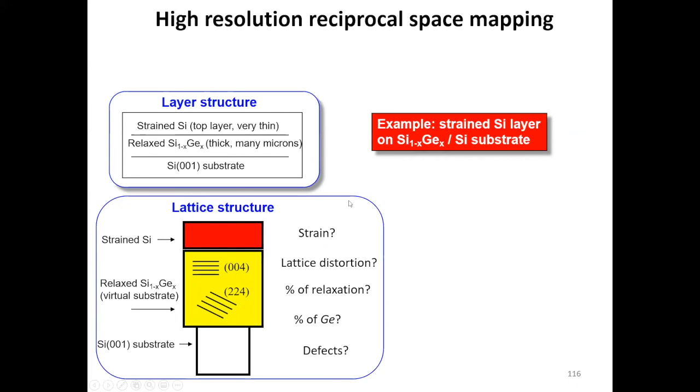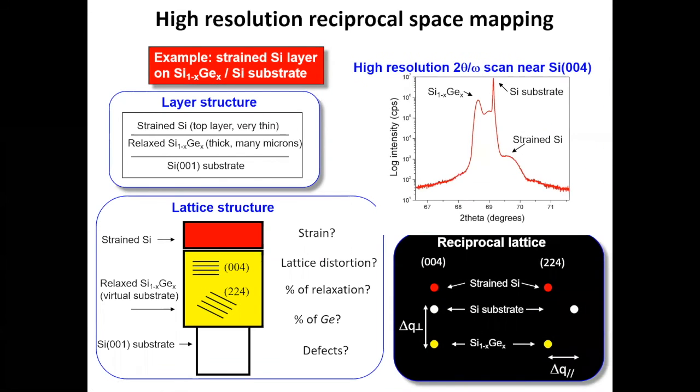So that's where a technique called reciprocal space mapping becomes valuable. So basically what you do in that case, you know that you are dealing with a single crystal. What you do is you magnify, enlarge here, and you actually make your probe size smaller. So you can actually see details of how that peak is shaped in the reciprocal space. How do you do that?